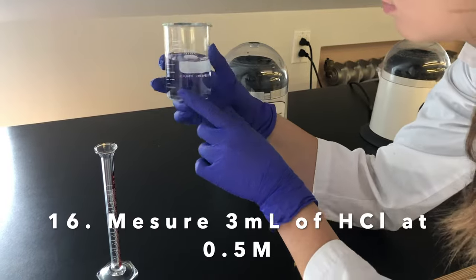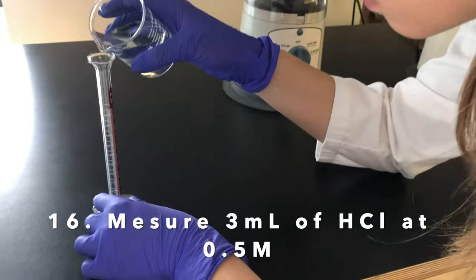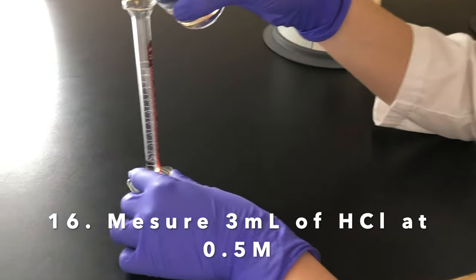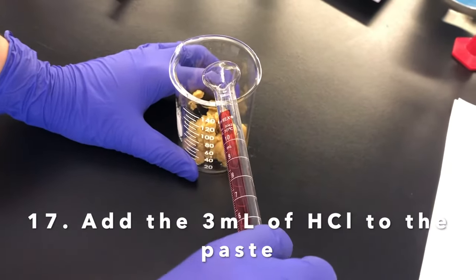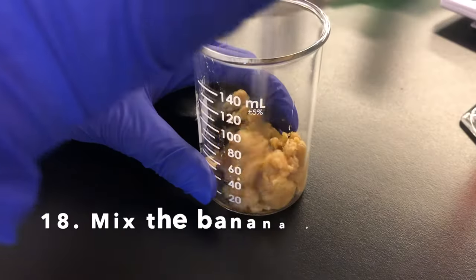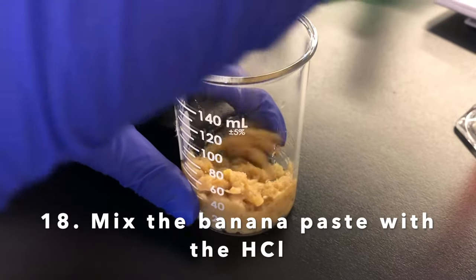Marion is going to pour 3 ml of our HCl solution into the 10 ml graduated cylinder. She will then be adding the 3 ml of HCl into our banana paste and mixing it in.